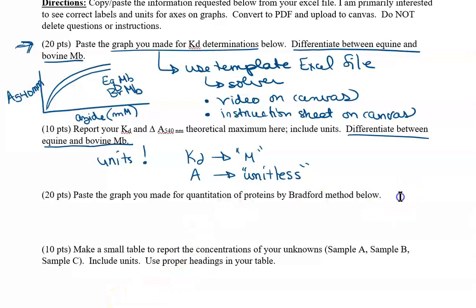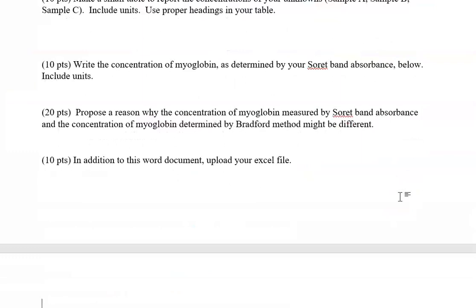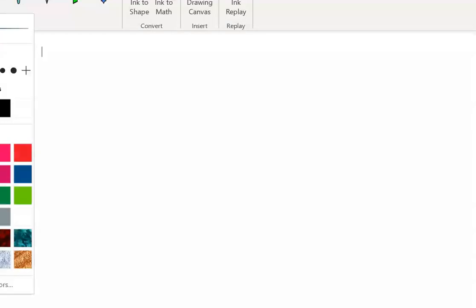And this is a commonly used method, right, for determining concentration of an unknown sample. I'm not going to go all the way back to Excel and show you how to make the graph. So please do make sure that you rely on help videos and peer support for how to use Excel and generate a graph. But I will show you what should be on each axis.